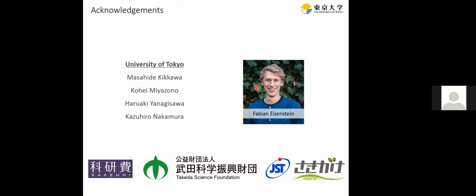Yeah, I can read it out. Thanks, Rado. That was really great. Thanks for sharing your experimental process as well. I got a lot out of that. I was wondering about the phase plate and why you think that there was a slightly worse resolution when you did reconstructions with the phase plate as opposed to without. I've been reading about your work on this, trying to figure out what the theoretical explanation would be. Is it due to inelastic scattering or loss of signal as it passes through the phase plate, as you've described before? And as a follow-up, do you still see a role for the phase plate in single particle cryo-EM?